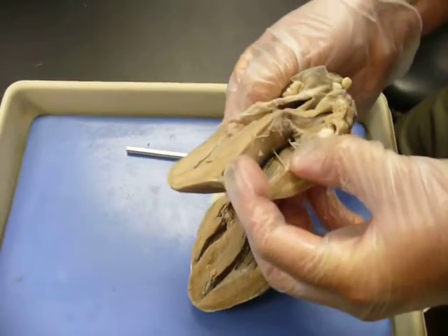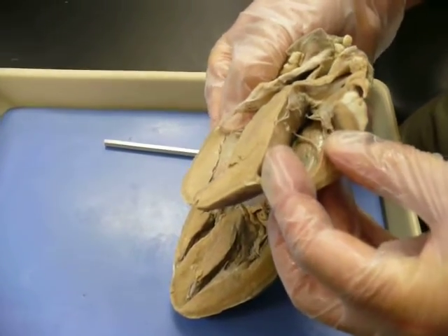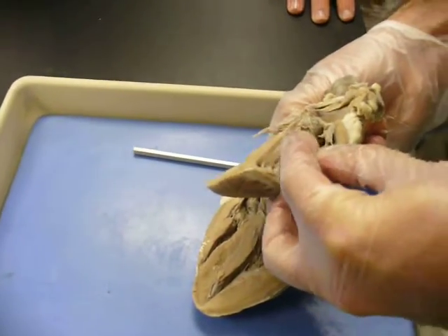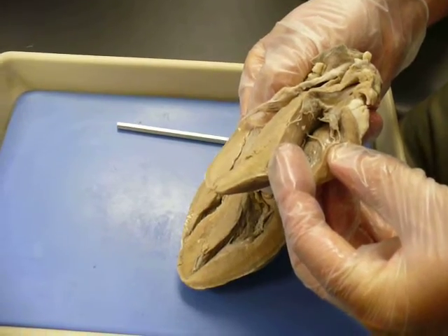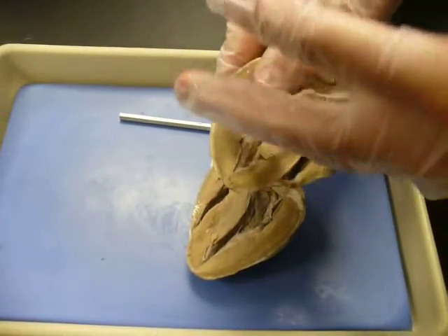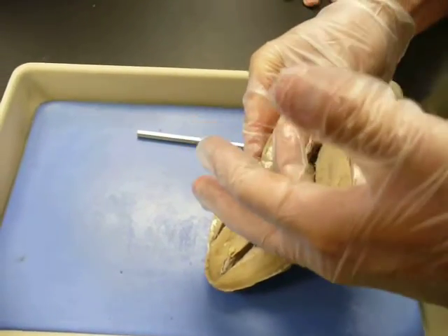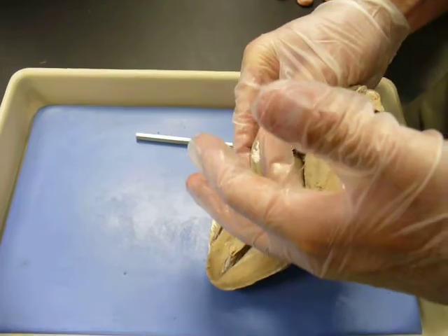This is still the right ventricle, and the way you can tell is because of this moderator band. Blood comes in through the right ventricle, and the increase in pressure causes this tricuspid valve to slam shut.